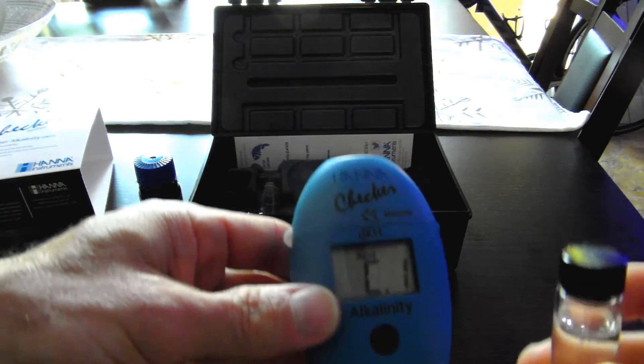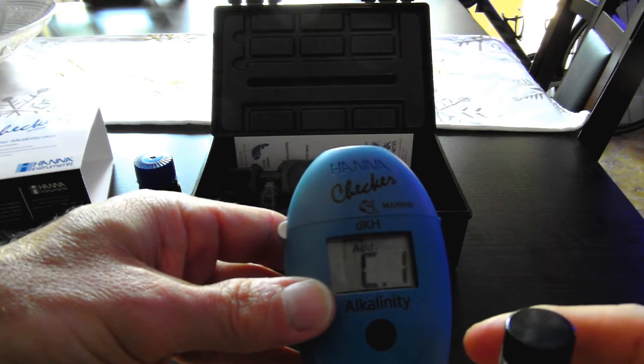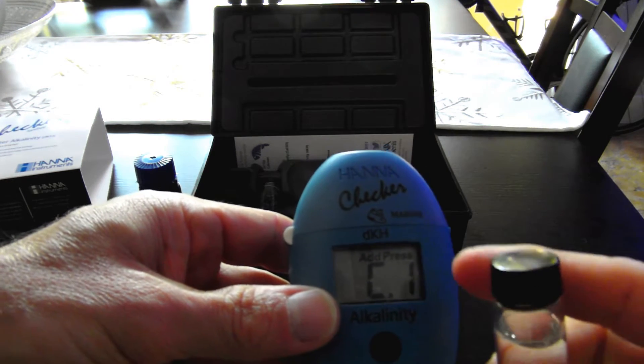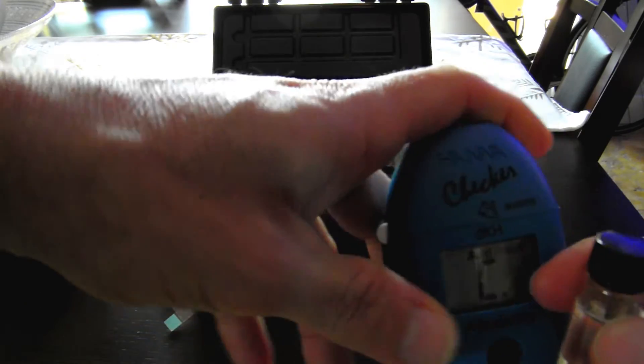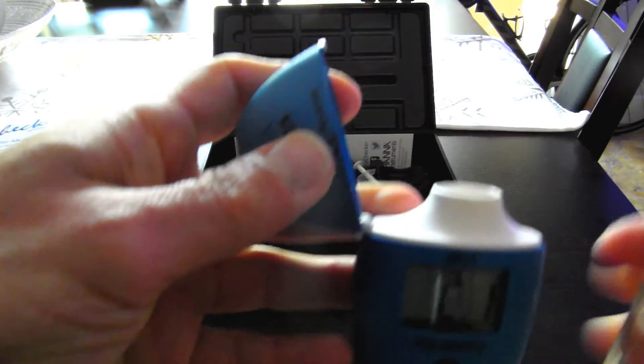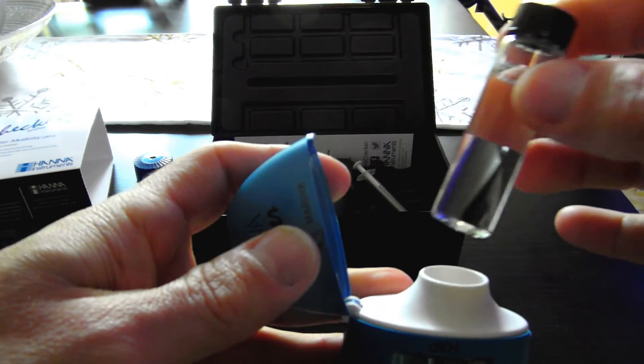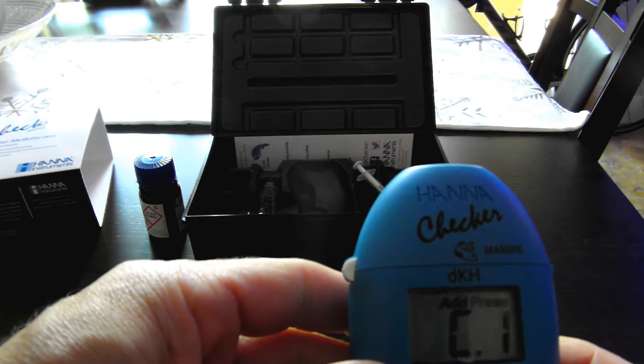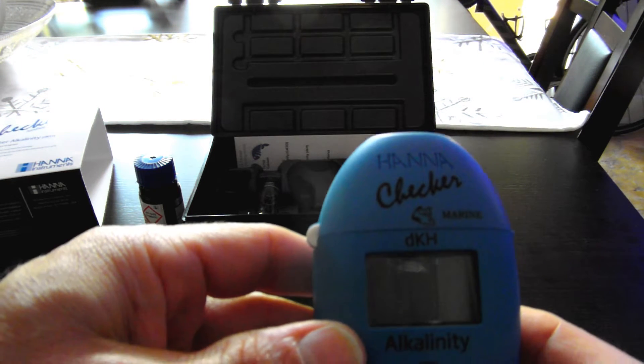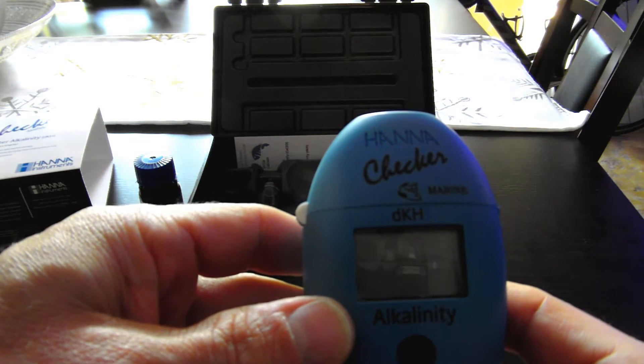And then with the Hanna Checker on and showing cuvette 1 or C1 with the press word flashing, I'm going to open up the lid. I've dried the bottle off, I'm going to place it inside, and then I'm going to close the cap, let it snap, and press the button.